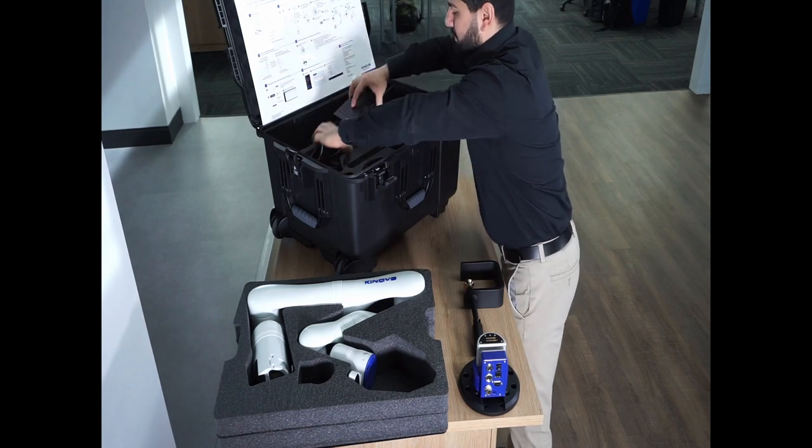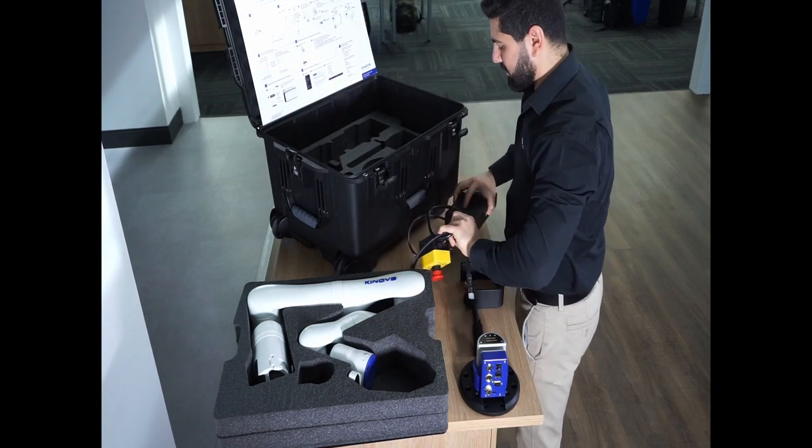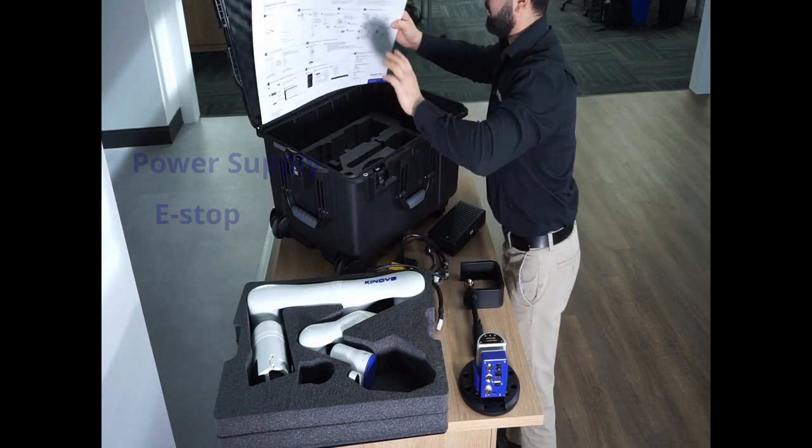In the second stage of the box, you will also find the emergency stop or e-stop, and the power supply.